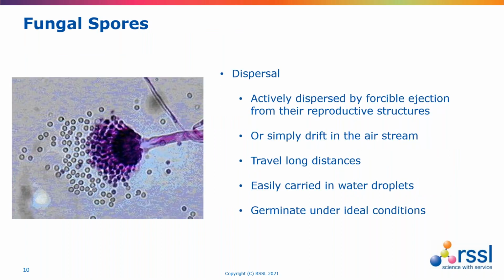There's also another difference in that bacterial spores are static unless they're physically removed. So there'll be a population of spores on a surface, but that's it. They're there until some physical or mechanical activity shifts them. Fungal spores, in contrast, can travel long distances, and the distance traveled depends upon the type of the fungus and the prevailing conditions.